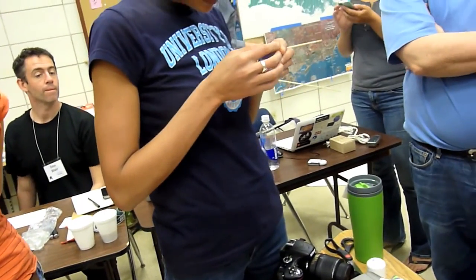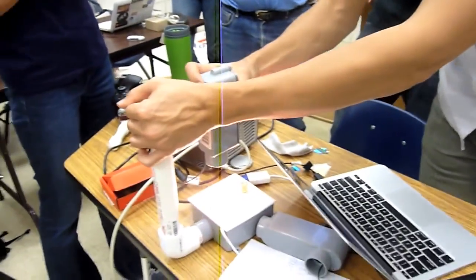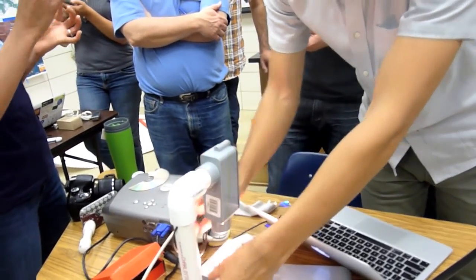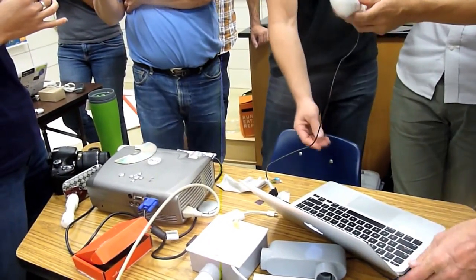For instance, in a desktop spectrometer, the light source is placed underneath, and you can set a petri dish with your sample. Oh no, that doesn't work. You have to pull the whole thing off. And then if you can lift this, we'll try to get a really good one.